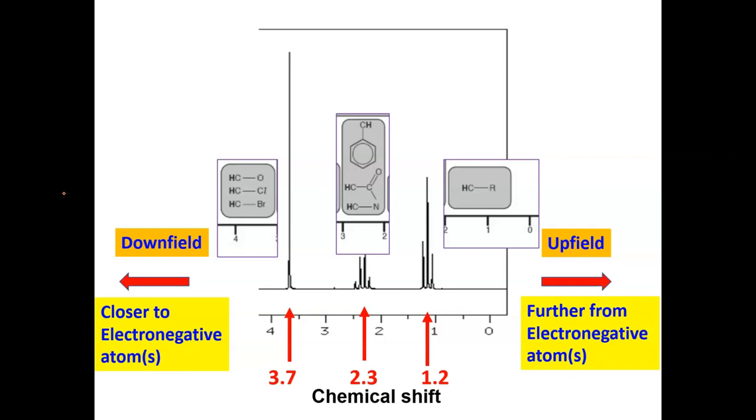And these are going to be found around about 1 to 2 on the data sheet. As you can see, very obviously, that triplet, those three peaks, is the three hydrogens in the methyl group at the left-hand end of the structure, which of course is part of our ester compound.